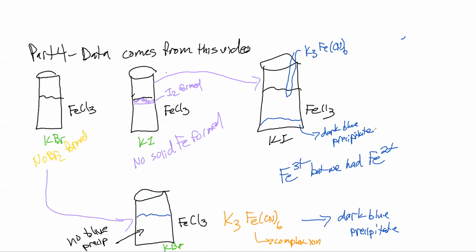And so you can use that to answer your question about, do you have any Fe2+ at the end of your reaction?